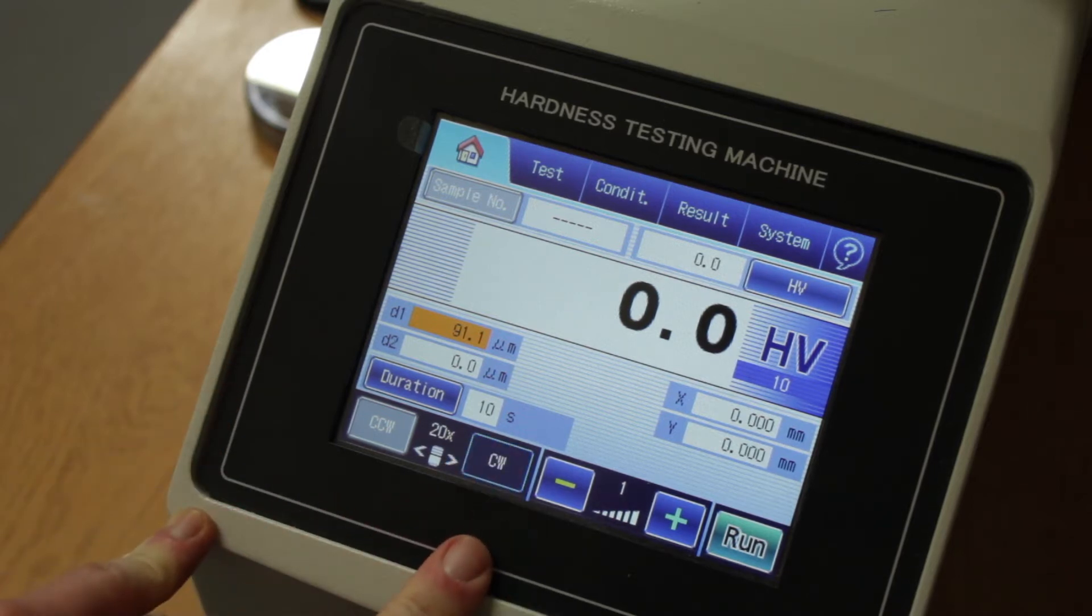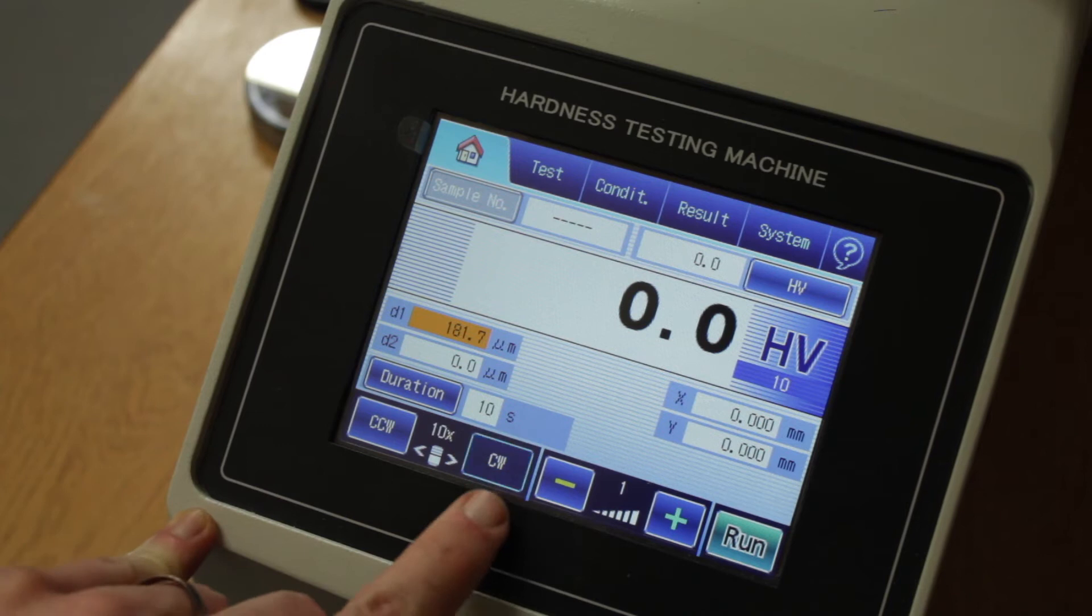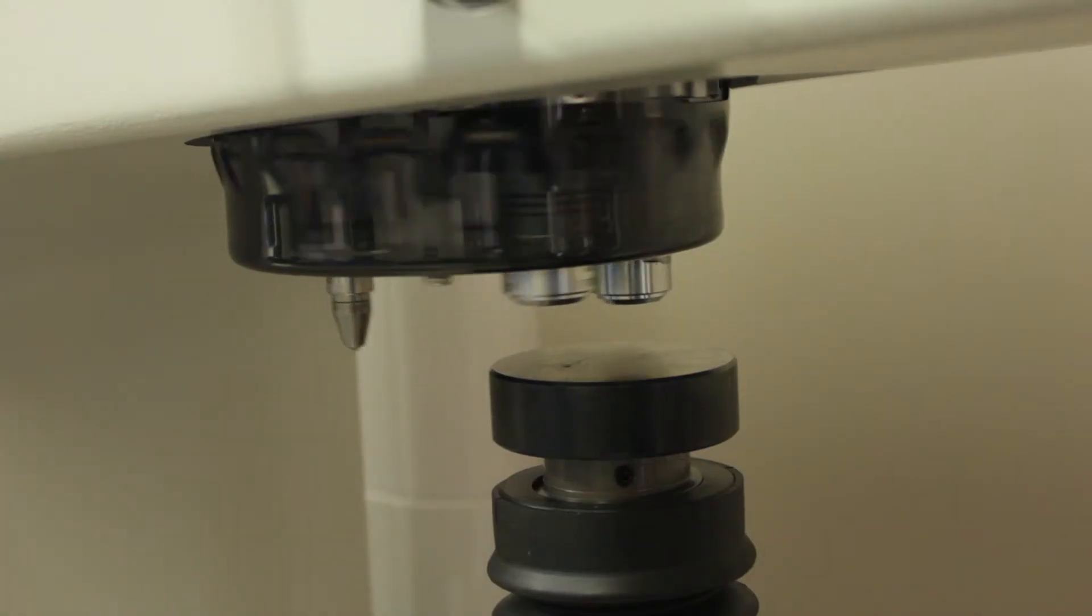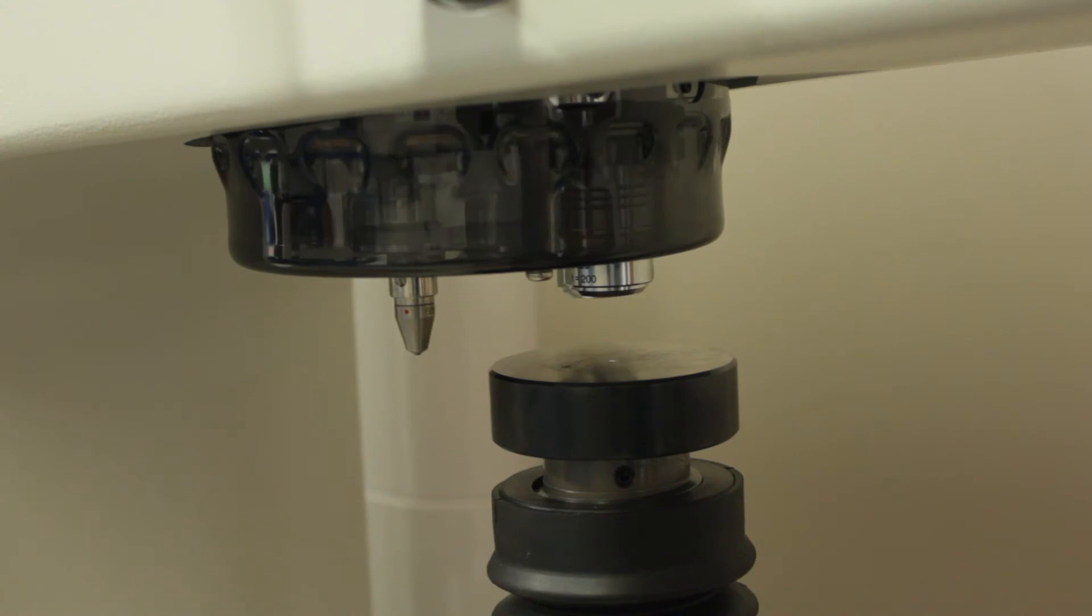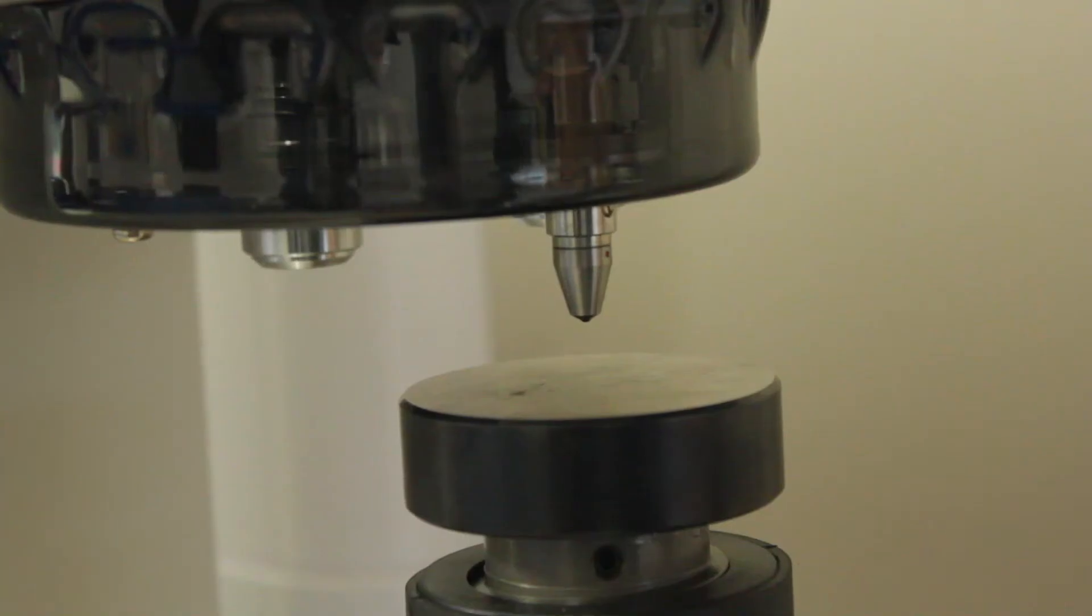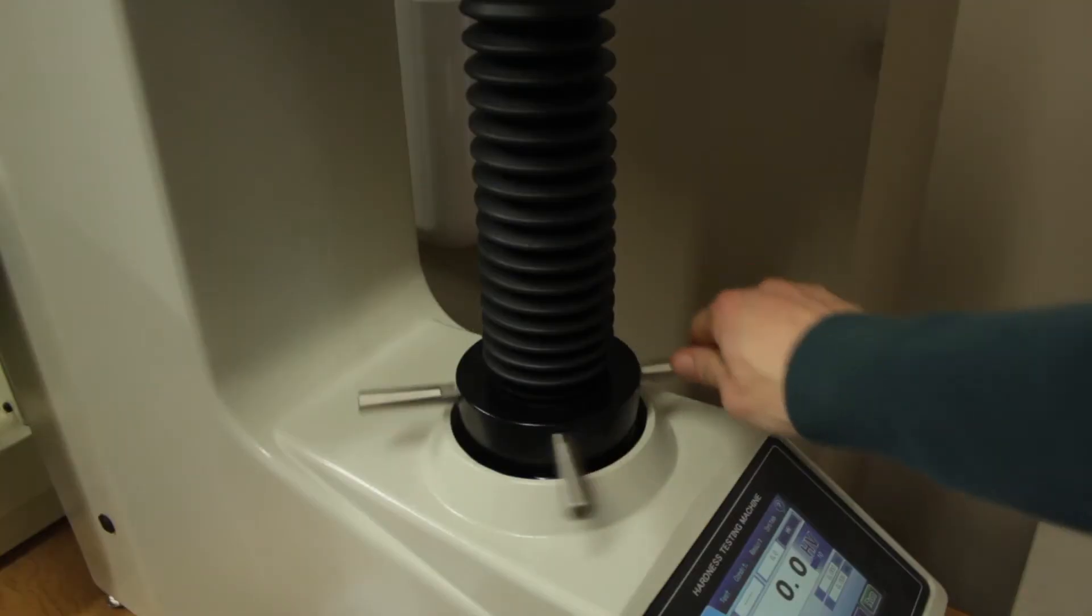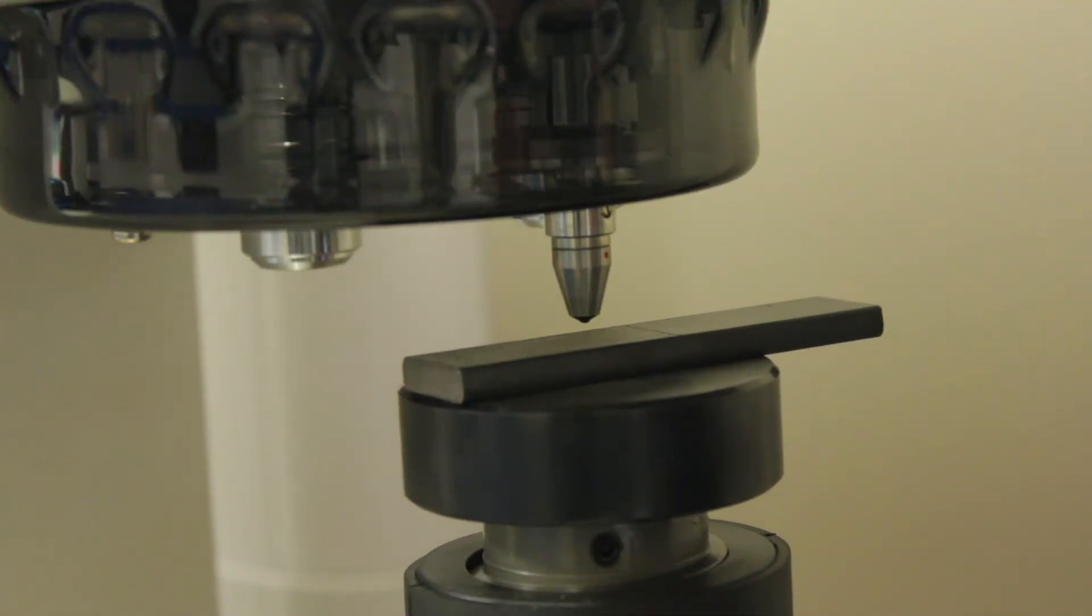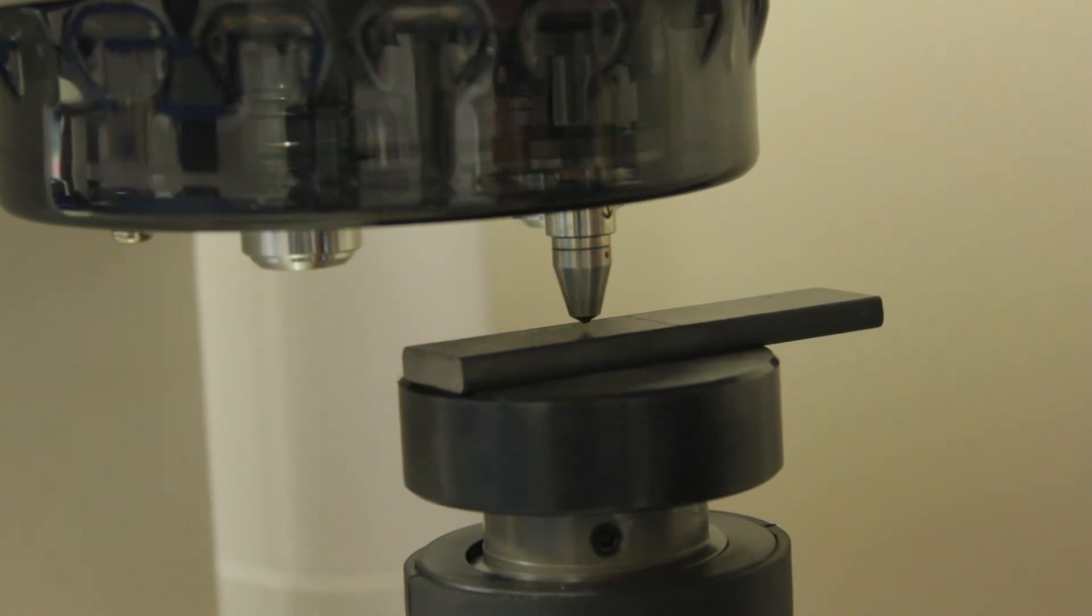Next, hit the counterclockwise and clockwise button to index the turret. To avoid damage to the diamond, ensure there's clearance before indexing. You'll need to index the turret until the diamond tip Vickers Hardness Probe is ready. Place the sample underneath and adjust the slide until the tip is about 1mm above the surface.